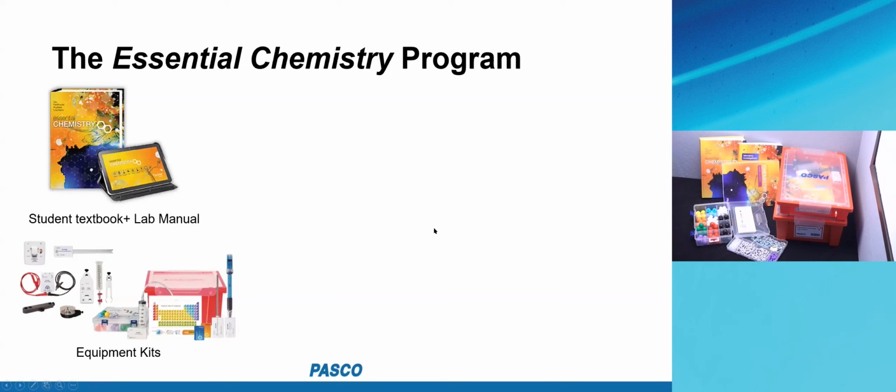So you've got these 2 bins that have sensors and a periodic table, and some other equipment. For example, I'm going to point to this on the screen. This is a condenser for when you do organic chemistry or you're doing distillation. That's what that's for. This piece right here holds up sensors on a ring stand.